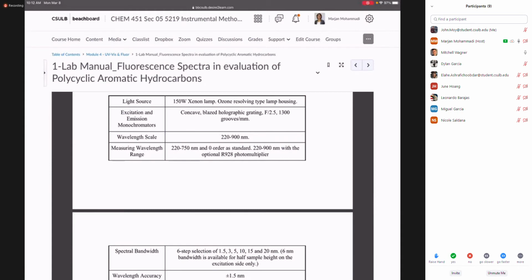You need to give me that curve that is coming from the UV. Because of that, I told you, you are going to give me 4 graphs of the UV data. Actually, guys, let's go overlay. You know what? For the UV part, give me one overlay graph, including all those concentrations in one graph. But I really prefer to have 4 graphs for calibration, because sometimes it's getting so busy and hectic, especially when you want to show 4 equations right there. If you think it's going to come out neat, you can do that.